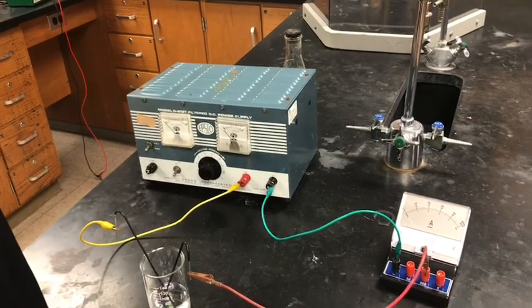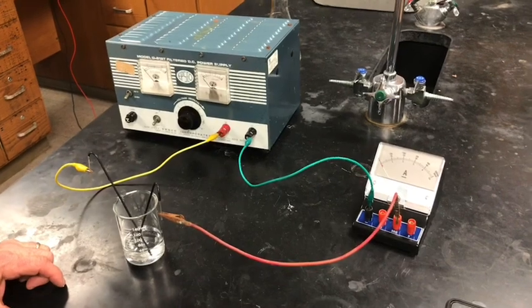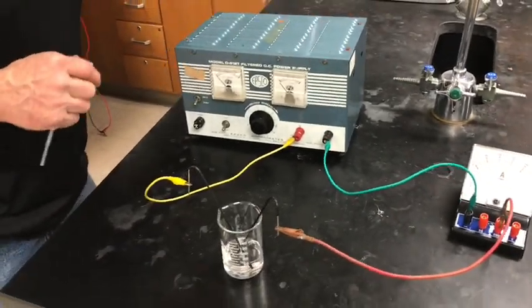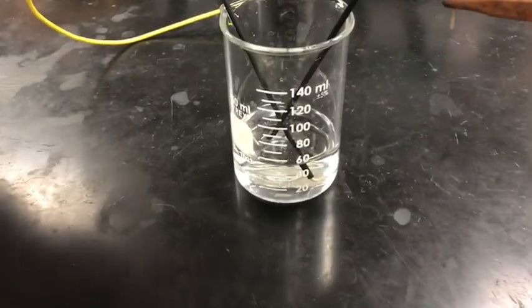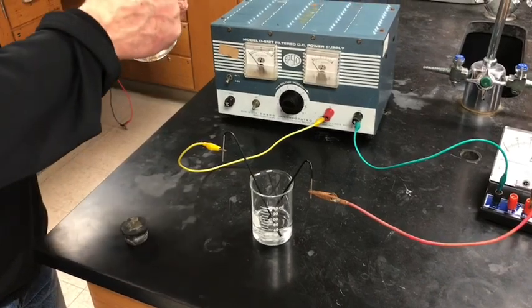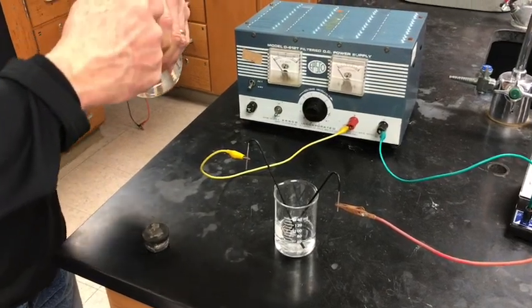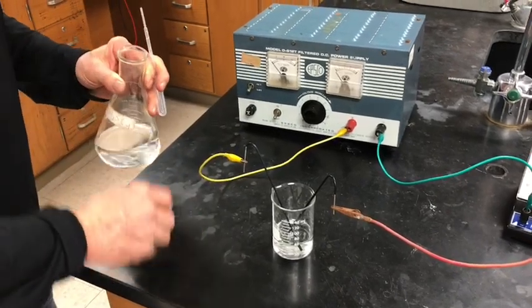We'll get our power supply going, but we need to acidify the solution first. This won't happen unless the sodium iodate solution is acidified — this is the sodium iodate solution with sodium iodate dissolved in it. We're adding a few milliliters of sulfuric acid — we're being wild and crazy today so we're giving it three squirts — that should be enough.